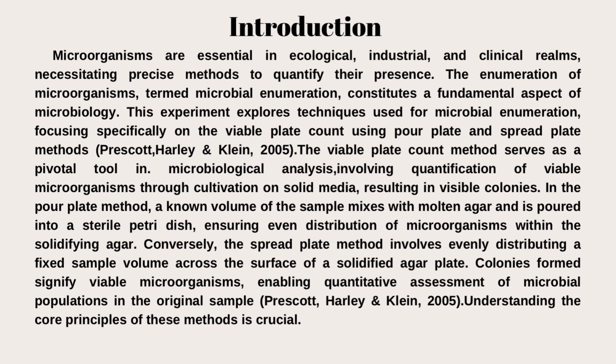In the pour plate method, a known volume of the sample is mixed with molten agar and put into a sterile petri dish, ensuring even distribution of microorganisms within the solidifying agar. Conversely, the spread plate method evenly distributes a fixed sample volume across the surface of a solidified agar plate. Colonies formed signify viable microorganisms, enabling quantitative assessment of the microbial population in the original sample.